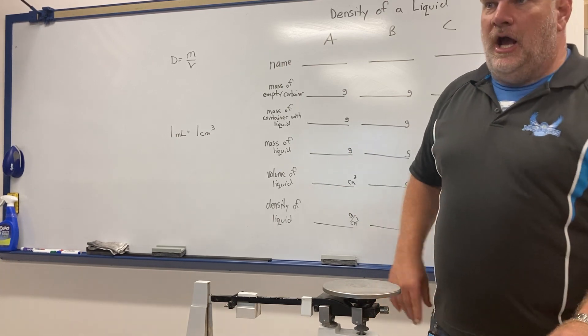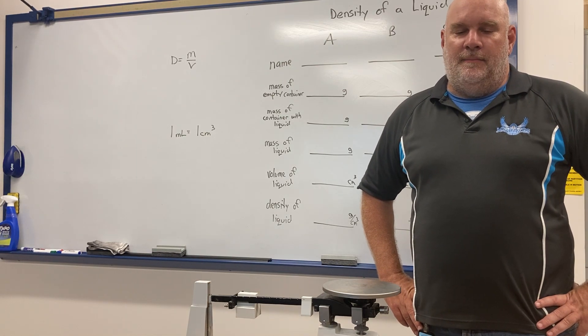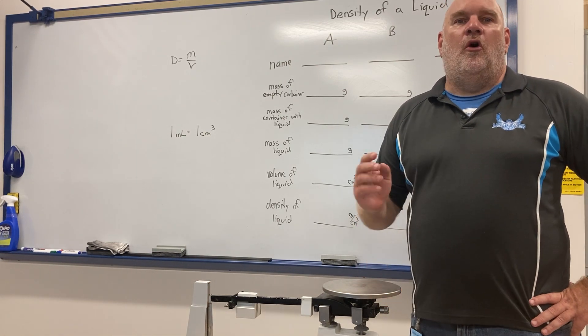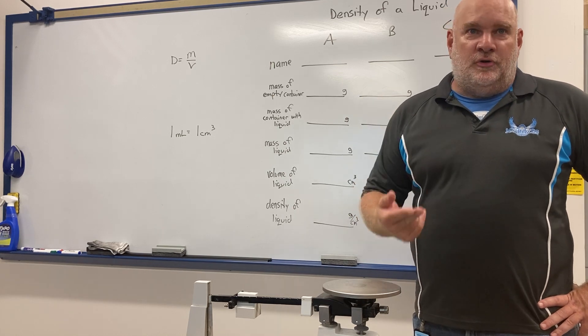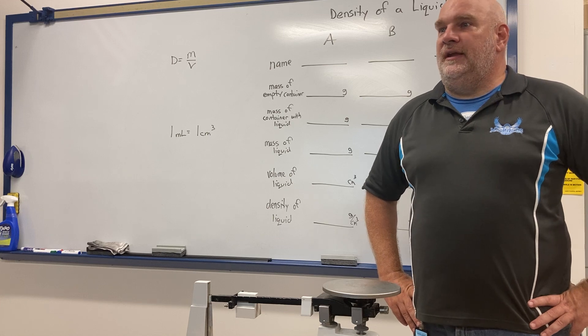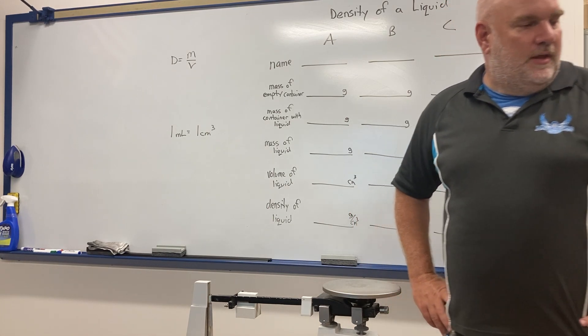What I need to do is isolate the mass of the container. Once I know the mass of the container with the liquid, I subtract the container's mass from that to get just the mass of the liquid itself.